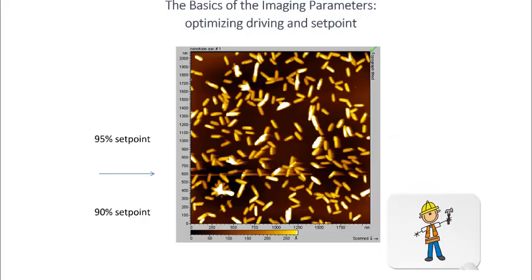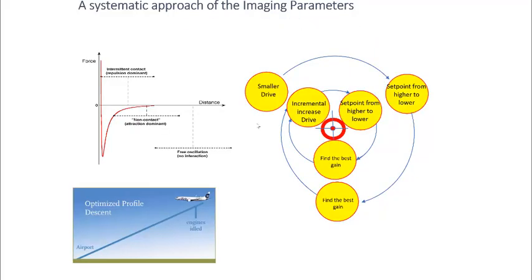Okay, so let's move forward here. Here's a procedure I normally ask people to follow in order to achieve high resolution. Here's my opinion: what do you think gives high resolution? Is it true non-contact mode or attractive mode that gives you high resolution, or is it tapping mode? My opinion is that somewhere in between gives you the highest resolution. What you need to know is how to approach gradually from an attractive or true non-contact mode into a tapping mode until your resolution is good enough. And if you further increase your engaged force to a hard tapping, your resolution is going to start to decrease. So at that moment, you achieve the highest resolution.